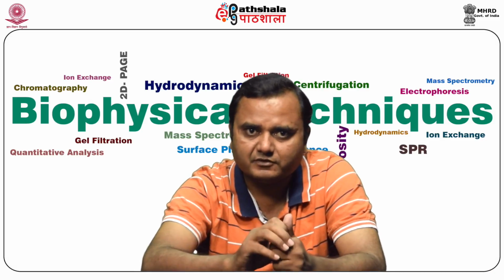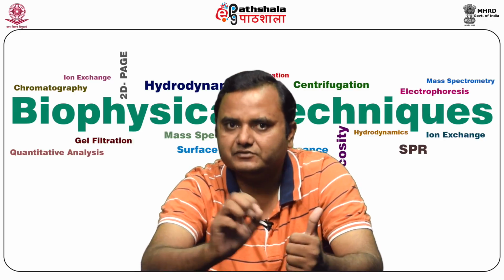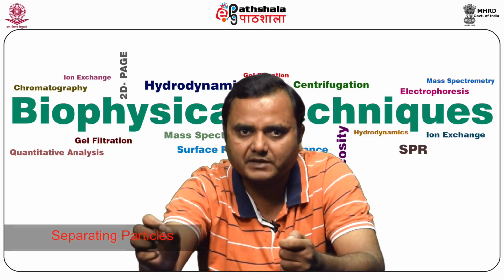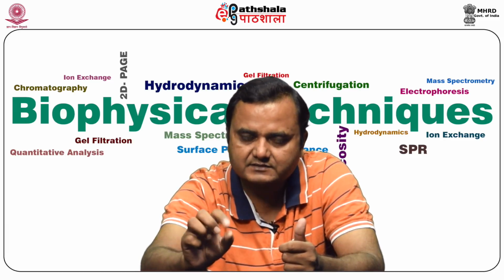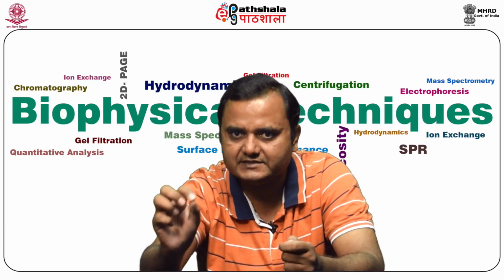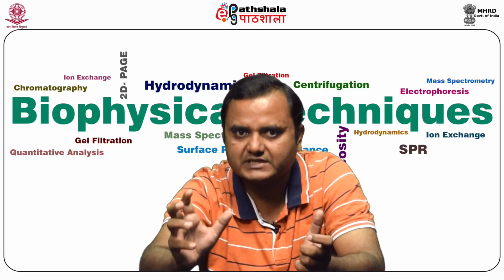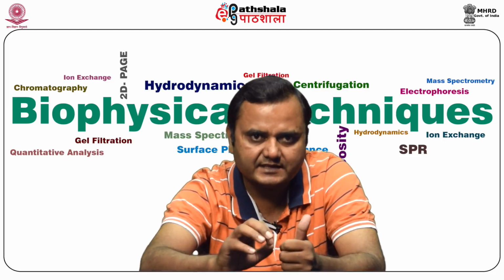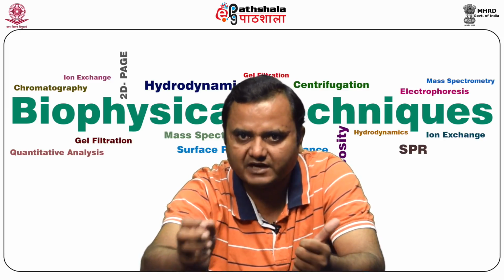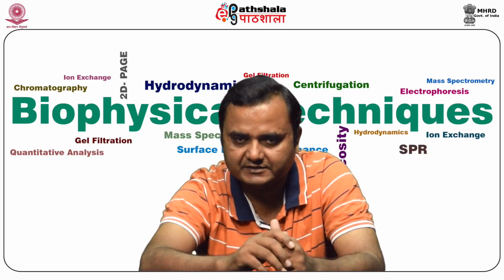So the basic concept of centrifugation is that a centrifuge is a device for separating particles from solution according to their size, their shape, their density, the viscosity of the medium, and of course the speed of the rotor. In biology, the particles are usually cells, subcellular organelles, viruses, and large molecules such as proteins and nucleic acids.